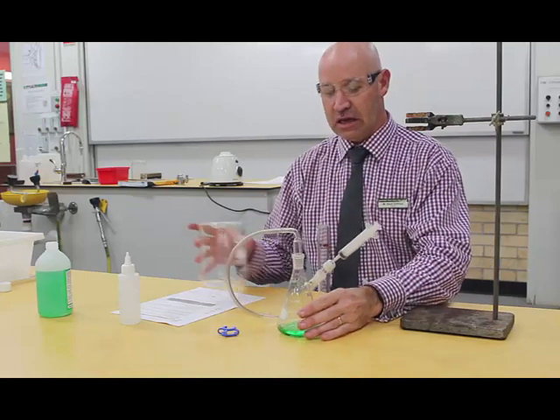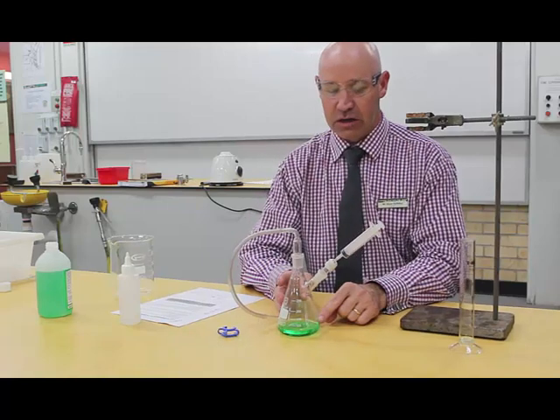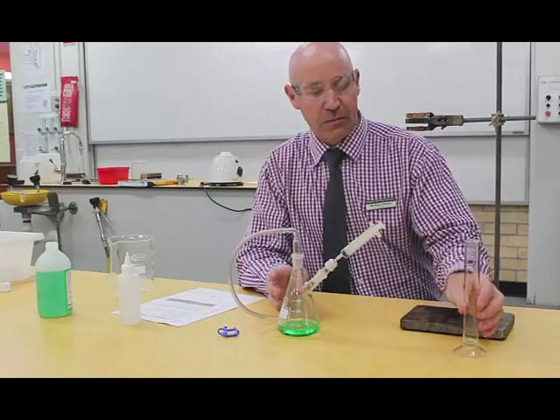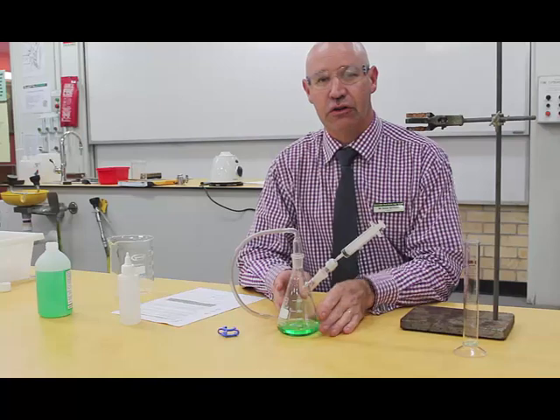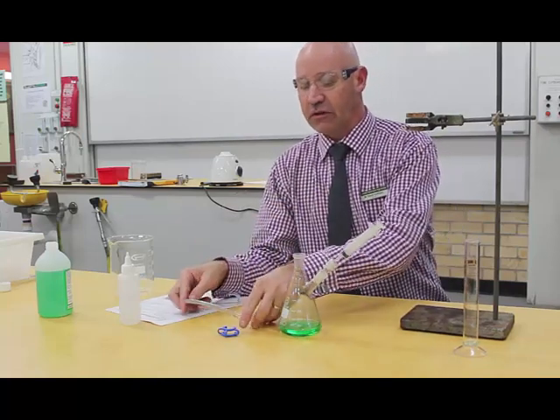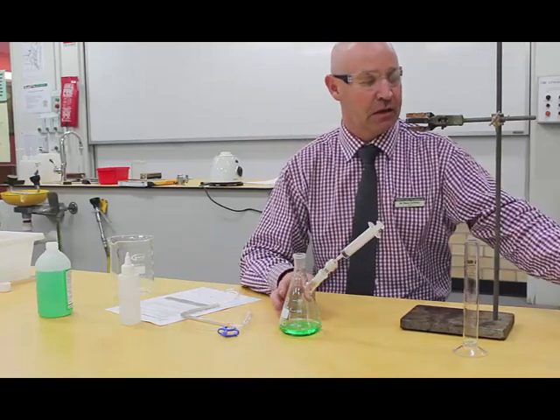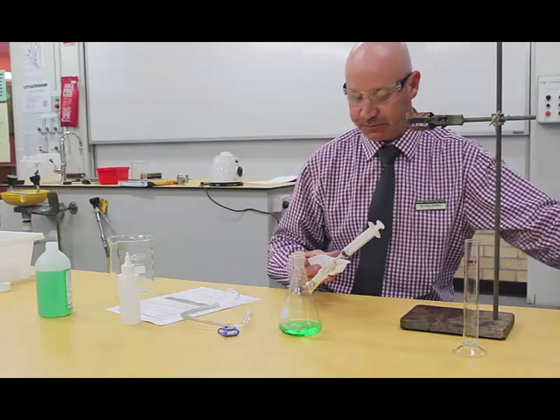So in our conical flask here, I've got 50 mils of a buffer solution. It's got a pH of 7. Certainly some of the ways that we can do this experiment is to modify the pH of the buffer. This time we're just going to focus on 7.